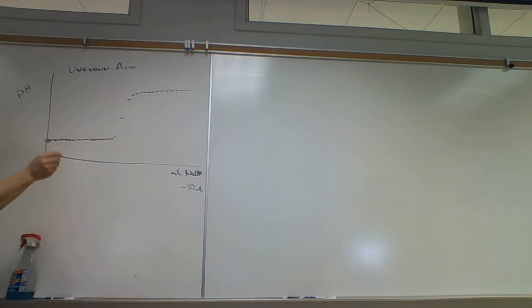That's assuming that we take a reading every 30 seconds, which probably isn't going to happen. It's probably going to take longer than 30 seconds to get a reading. So it's impossible. What we need to do is take readings at larger intervals, like a half a milliliter. Half milliliter intervals would be about 10 drops. Again, don't use drops. We're going to read the actual volume on the burette.